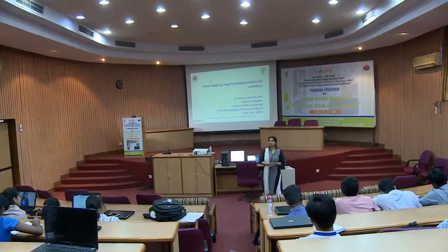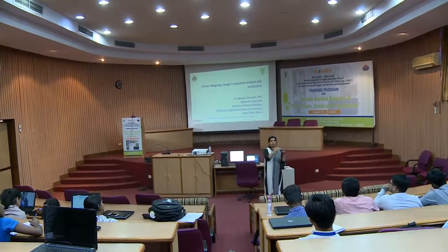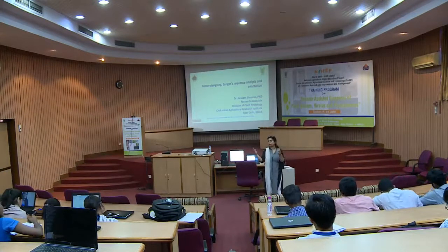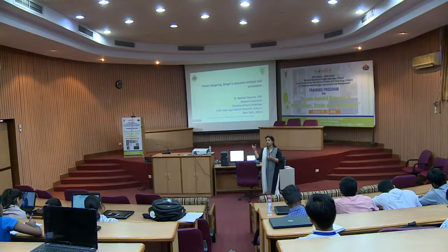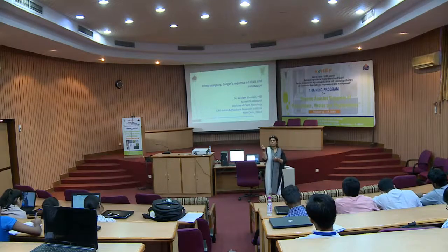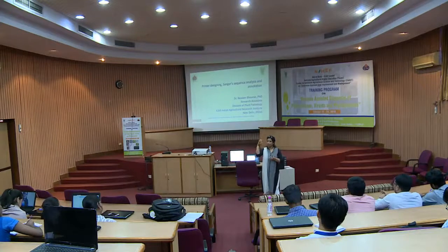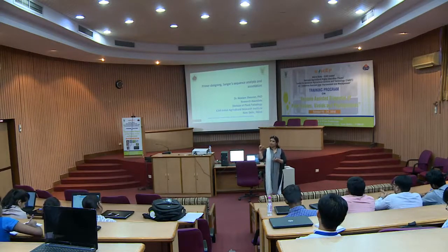Then the primer positioning, it should always be from 5 prime to 3 prime end, right. The designing should be 5 prime to 3 prime. So towards that 3 prime end, you ensure that there is some GC available over there. Why do we need that? Because the AT bonding is 2 and GC is 3. So that will ensure that your primer is binding tightly on your template, right. So, that also you can take care.